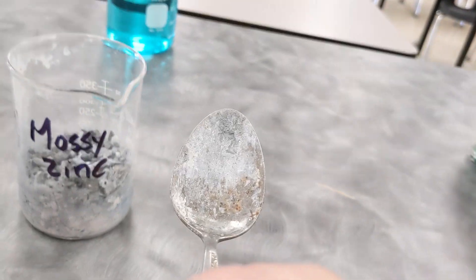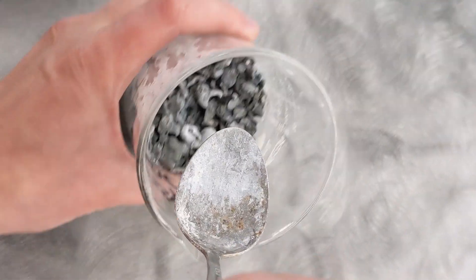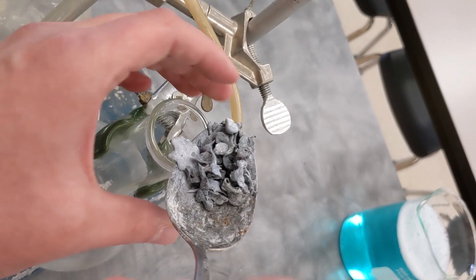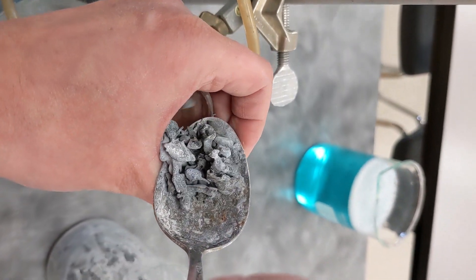To make the hydrogen, we're going to take this zinc and add it to the larger of the two flasks. The zinc will react with hydrochloric acid, producing hydrogen gas and aqueous zinc chloride solution.